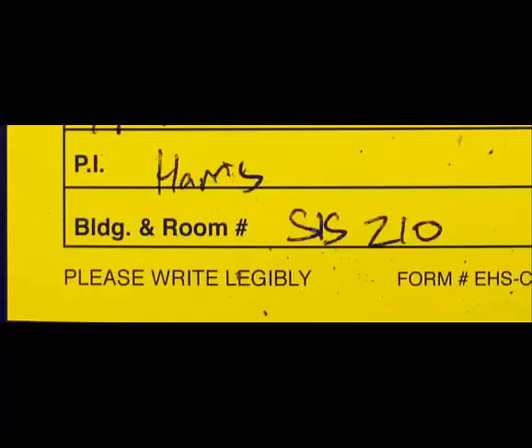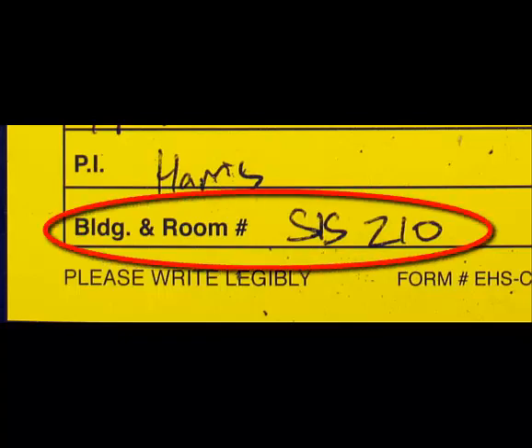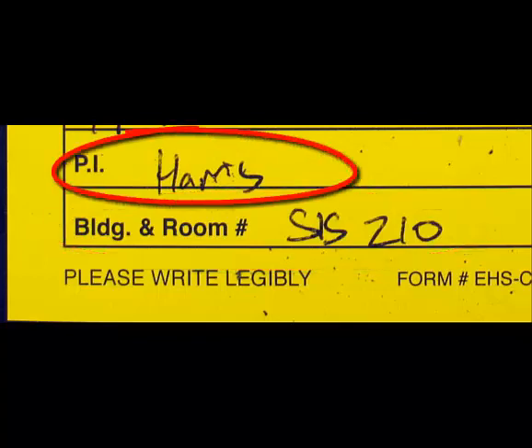Finally, please make sure that you complete the bottom section of each hazardous waste label, which is the contact section. This includes the building and room number associated with your laboratory, along with your professor or principal investigator's name.